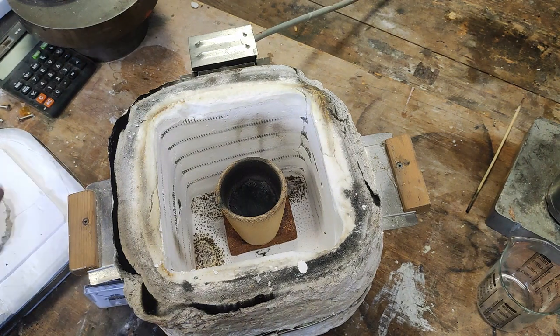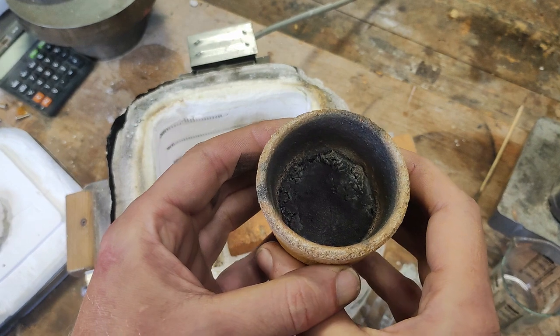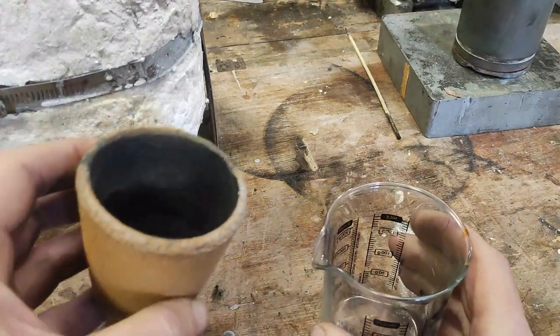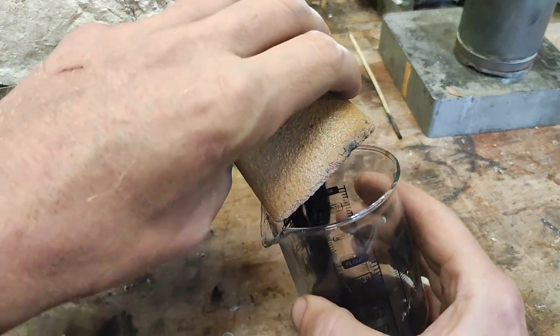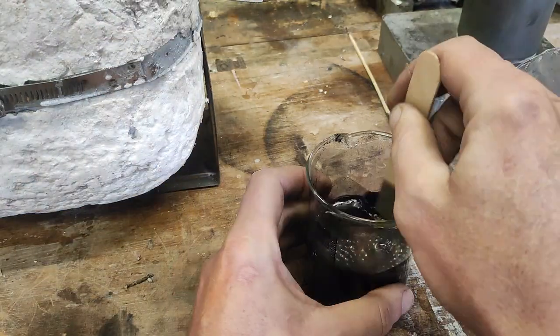Now, it's important not to expose it to the oxygen of the atmosphere until it's completely cooled. I'm not sure exactly what temperature the reaction happens at, but if you do know, please leave some comments below.